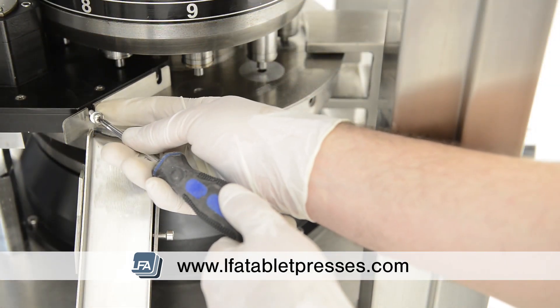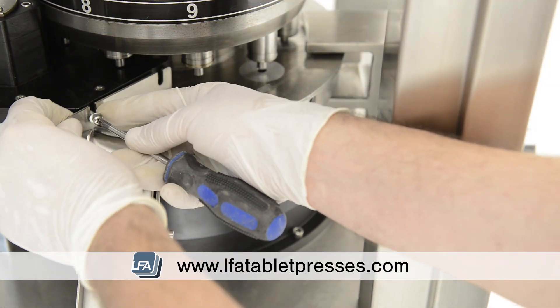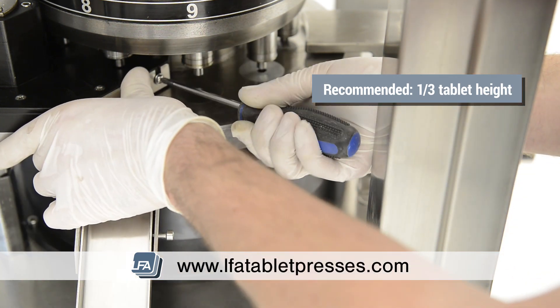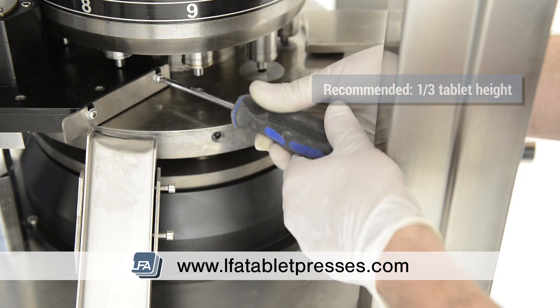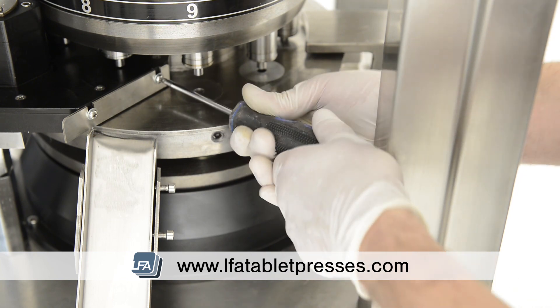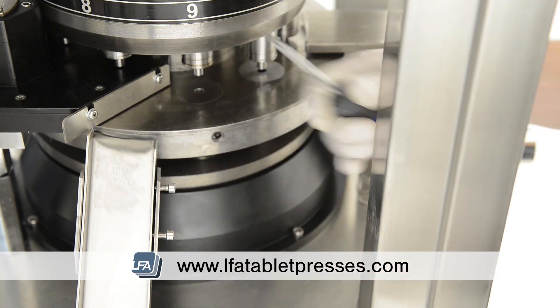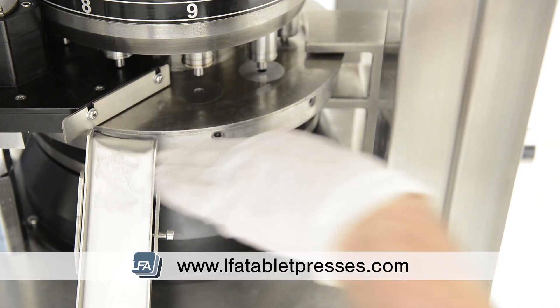Now replace the tablet takeoff blade. This doesn't need to be pushed down to the die table. Instead, it needs to be mounted one third of the tablet height. For example, if you have a three millimeter tablet height, the blade needs to be one millimeter high — it's not exact, but approximately. It needs to be high enough for the excess powder to pass under, but not a compressed tablet.